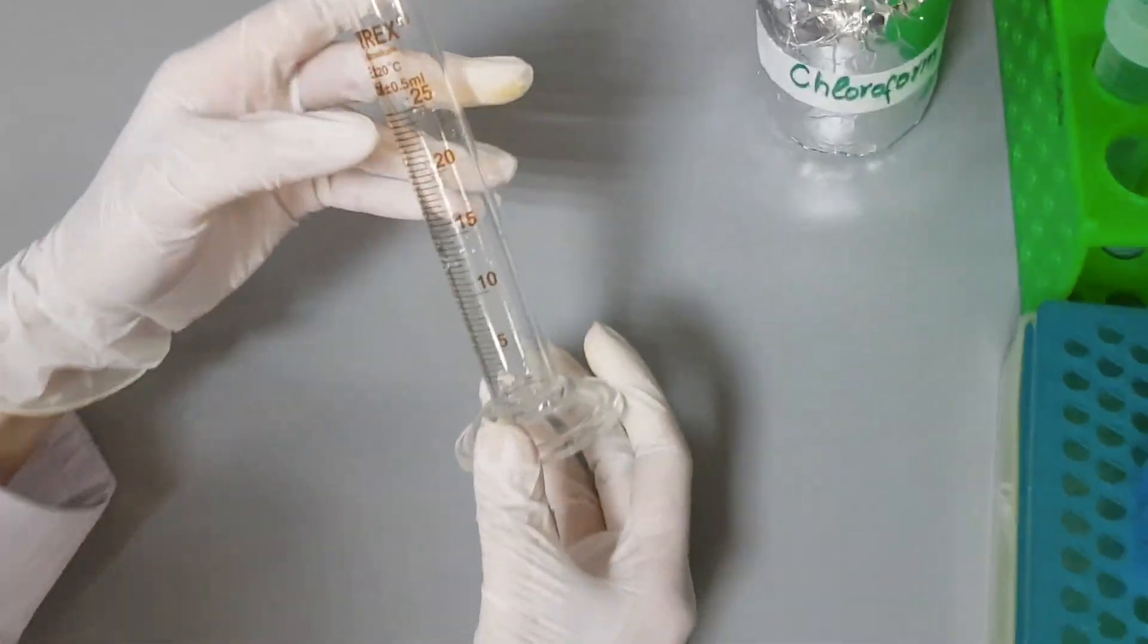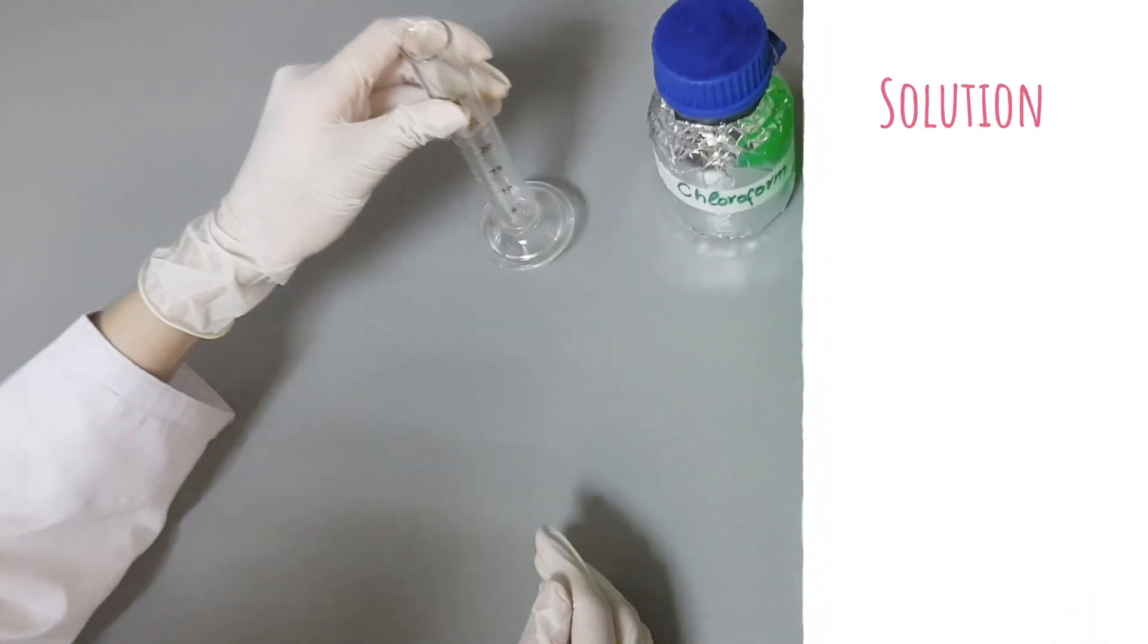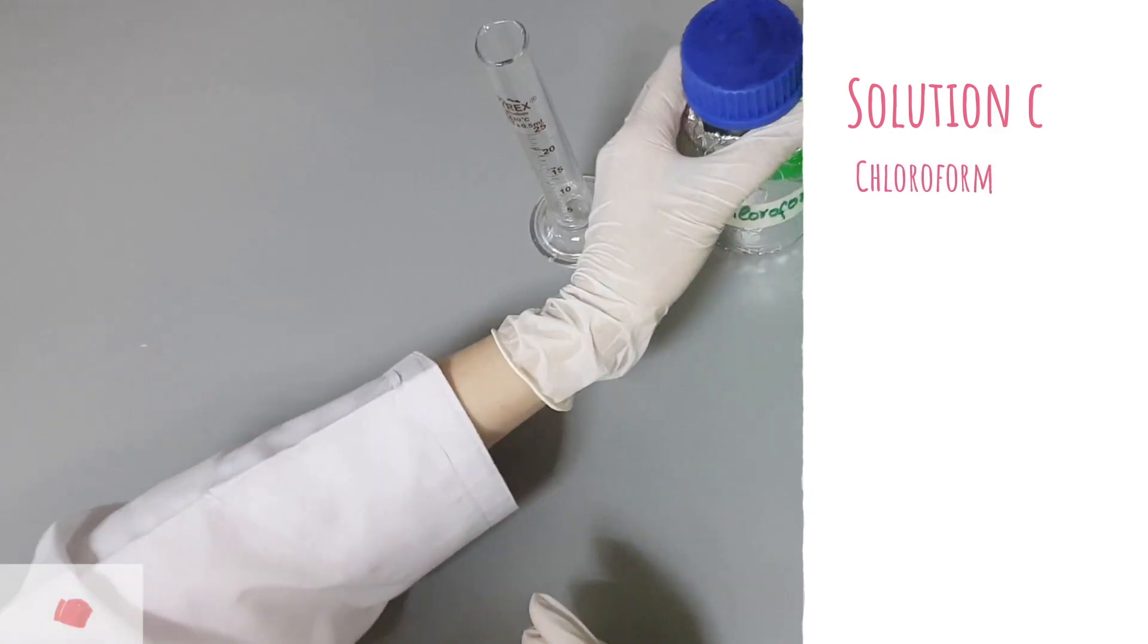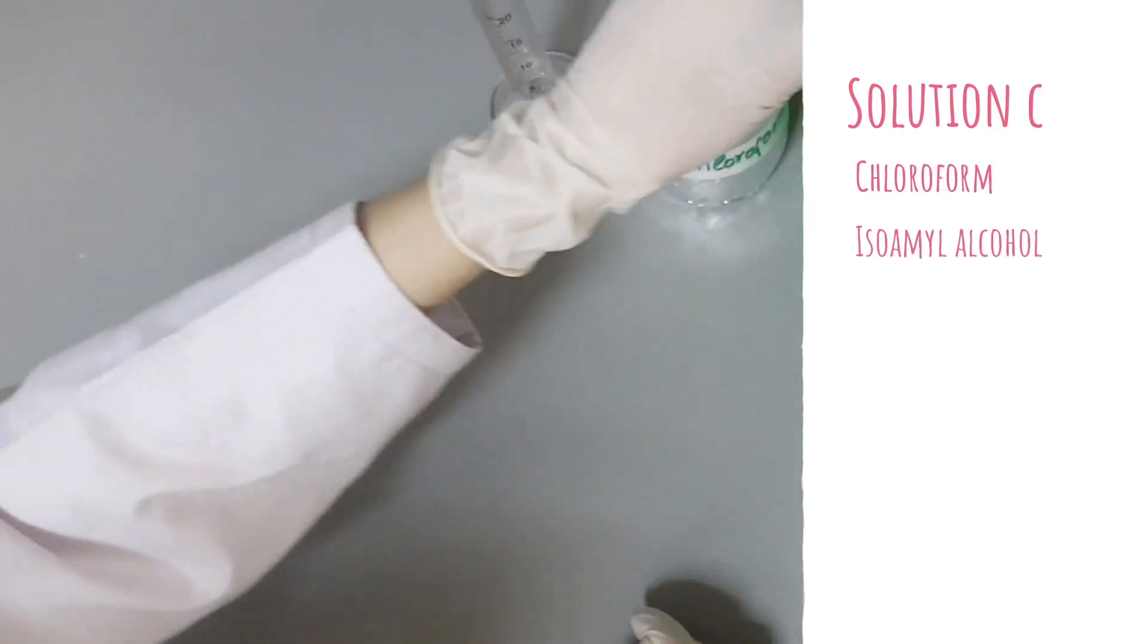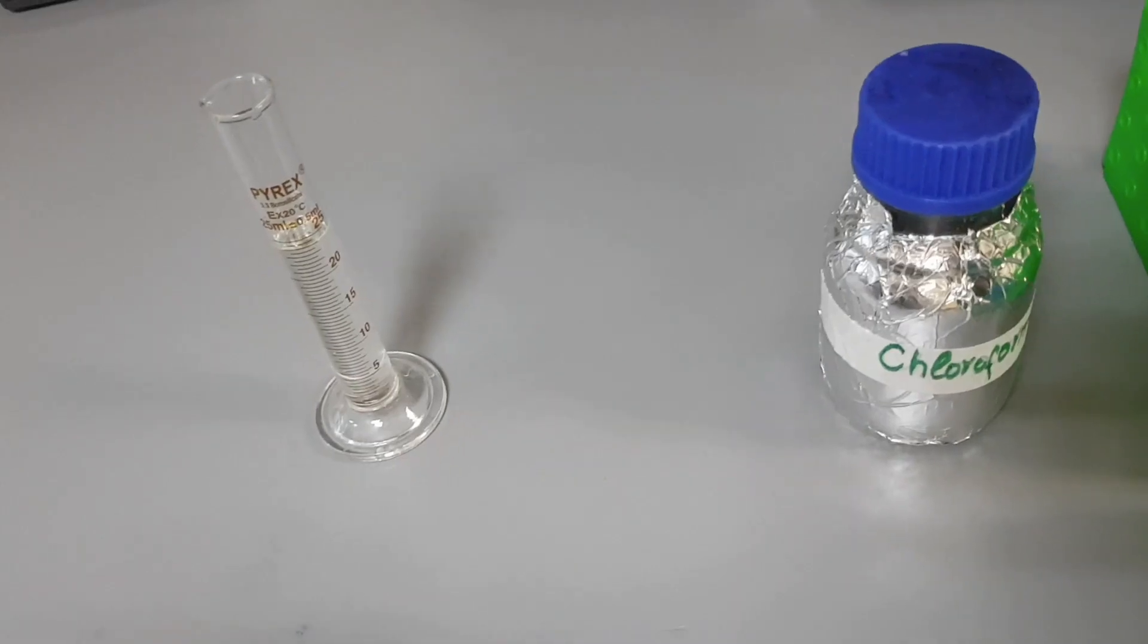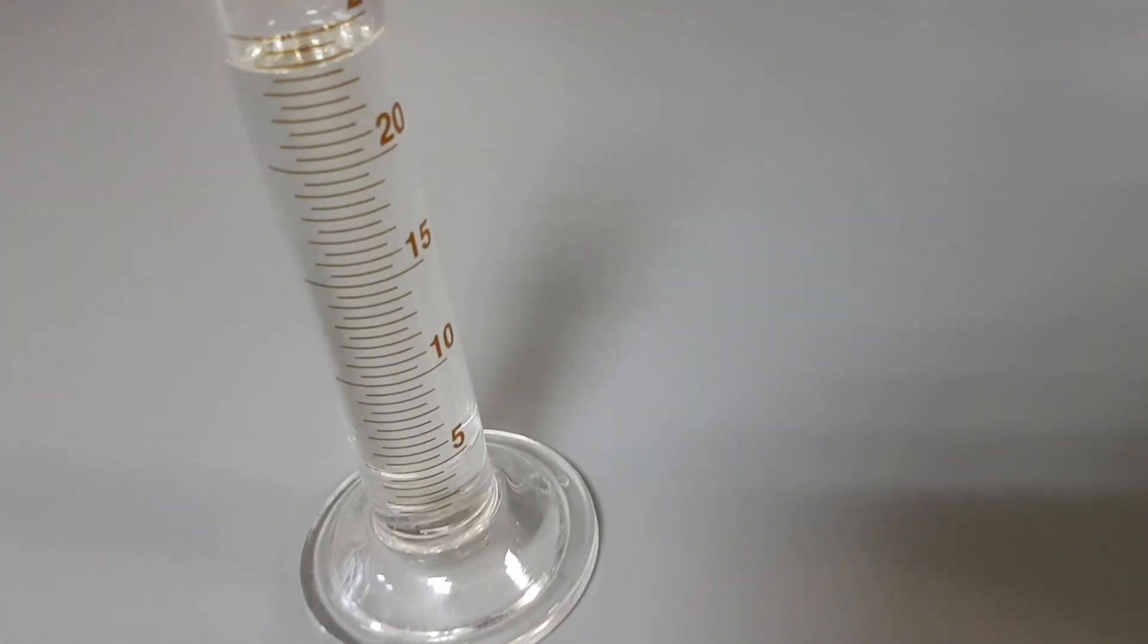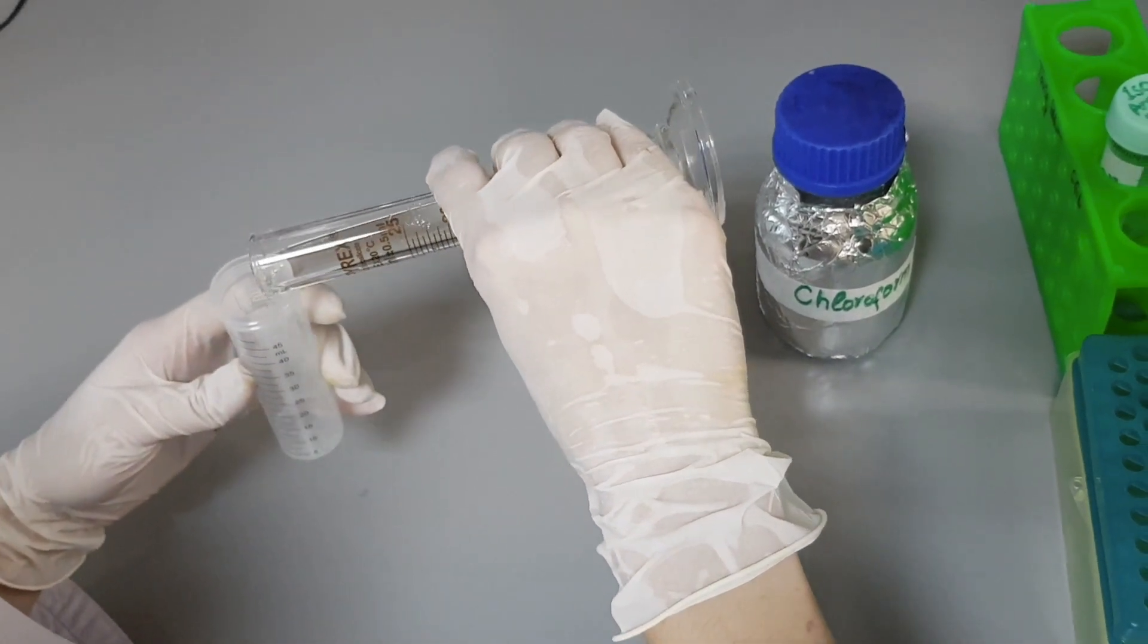Now we will discuss the preparation of solution C. The reagents we require to prepare solution C are chloroform and isoamyl alcohol. For preparing 25 ml of solution C, pour 24 ml chloroform in a measuring cylinder and then transfer it to a 50 ml falcon tube.